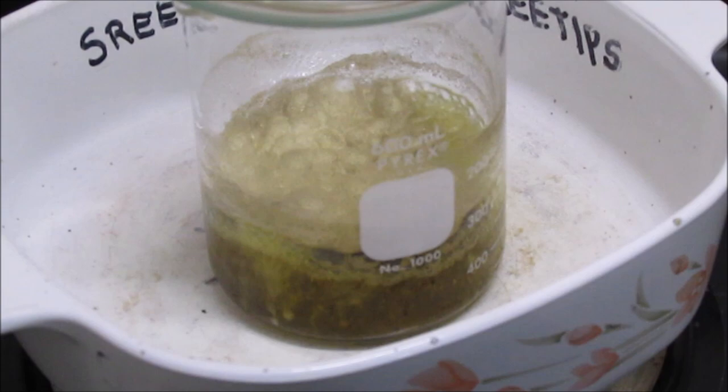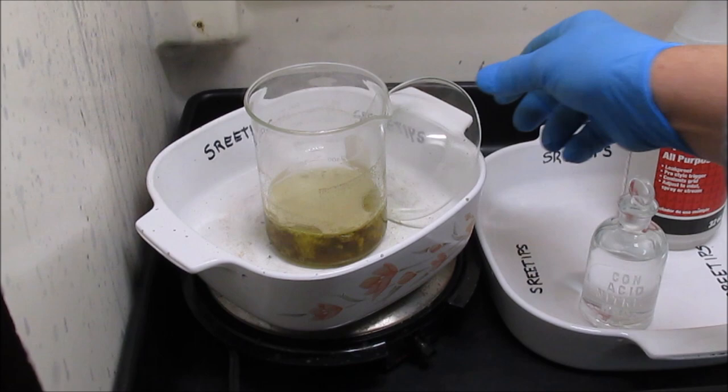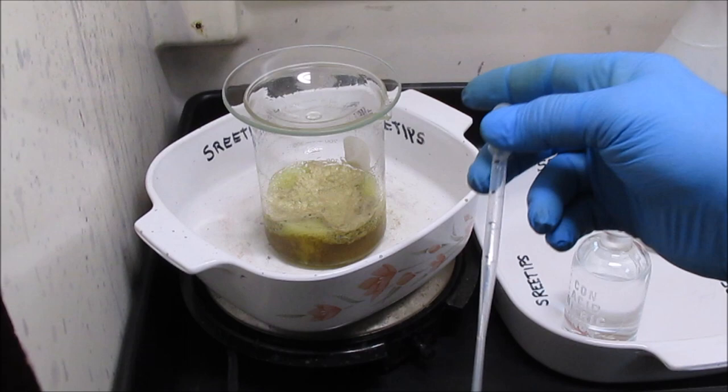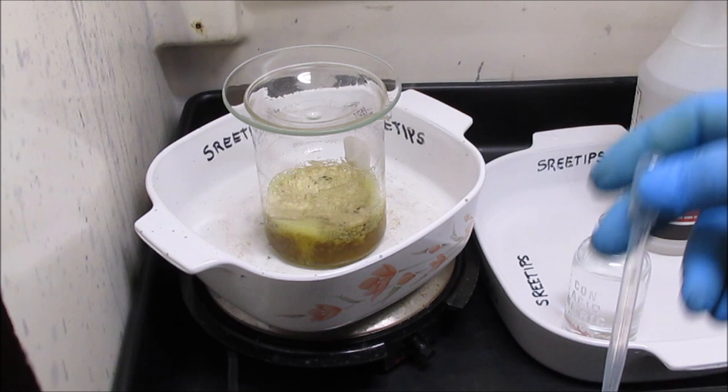That beaker's been on there boiling now for about 15 minutes. Inside it's 261 degrees. We've had the beaker on there now for about 20 minutes boiling in hydrochloric acid. The next step in the process calls for me to take that off the heat, filter it, incinerate the stuff again, and then go to a nitric acid boil. I don't think that's necessary.